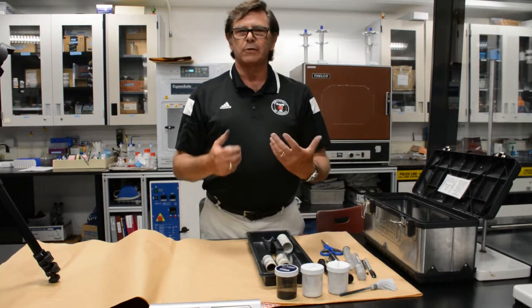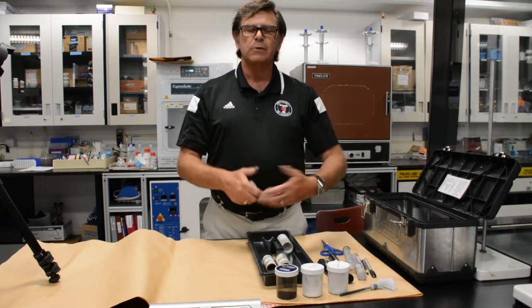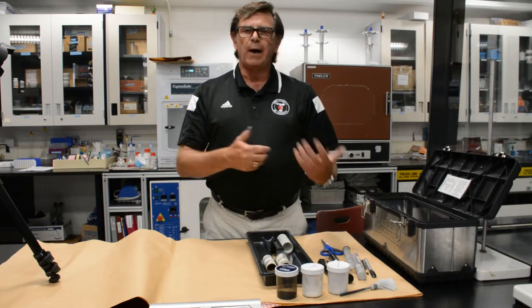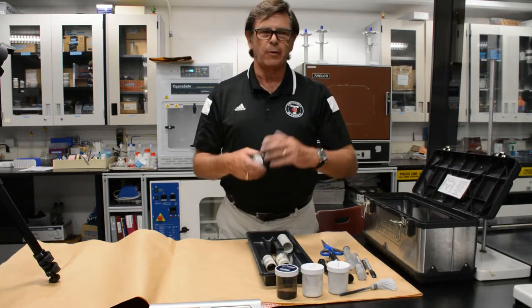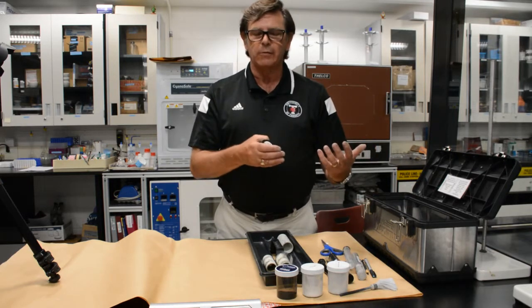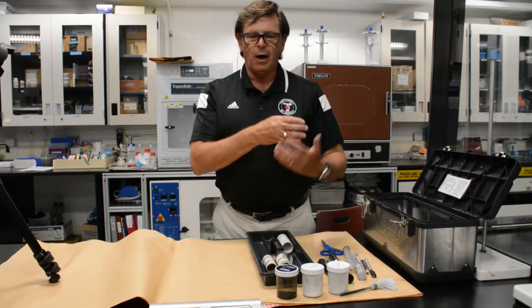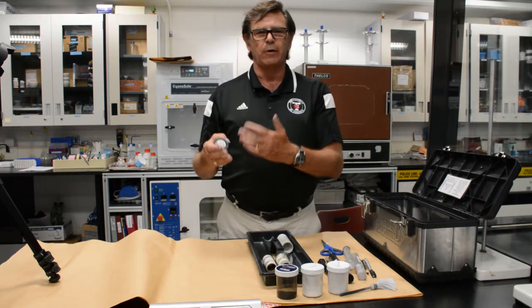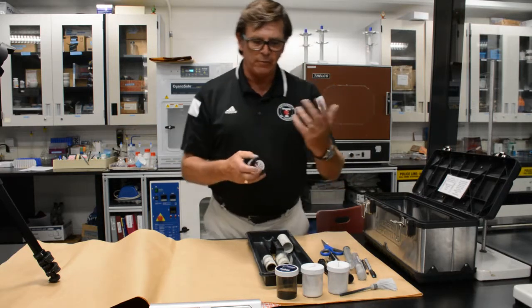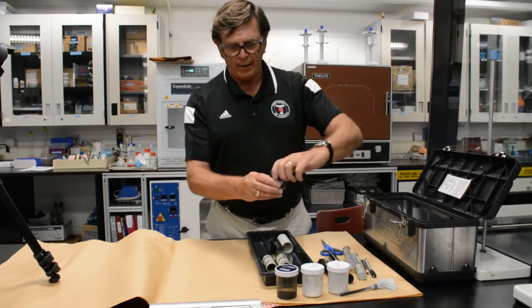Depending on what the surface color is that you are examining for fingerprints, you need the powder to have a contrast in order to see the actual detail of a fingerprint, or to notice that a fingerprint is even present. So for instance, if you're processing a white surface, you want to use a darker contrasting fingerprint powder, and vice versa. If it's a dark surface, you want to use a lighter powder.